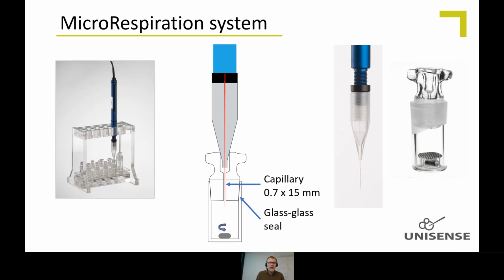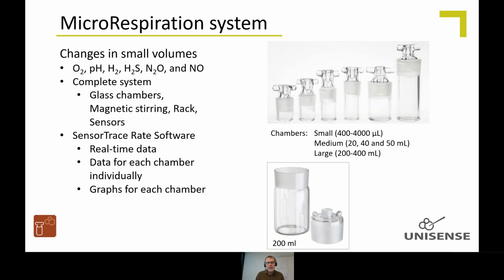And you can use different sizes of these chambers. We have the small ones from 400 microliters up to 4 milliliters. So these are the ones.